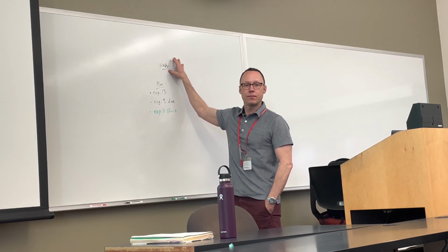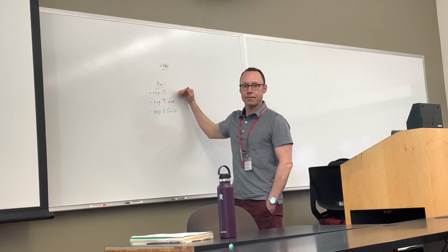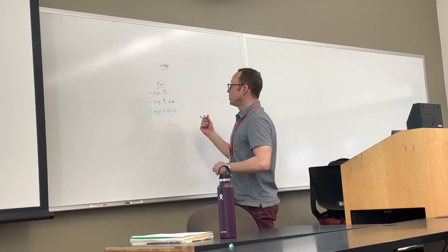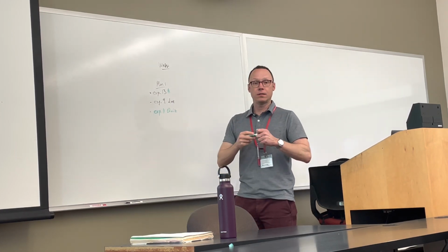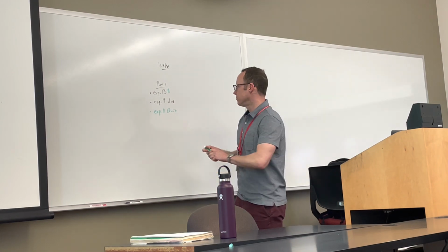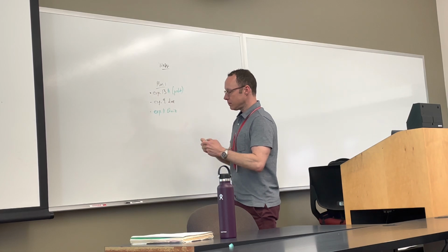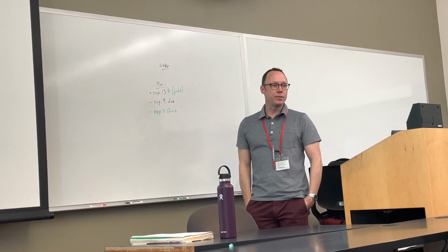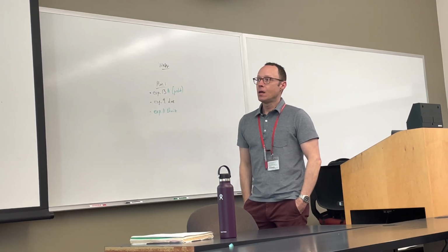So Monday we need a pre-lab? Yes, you'll need to have the pre-lab for 13 for that. Experiment 13 is a 2-reaction sequence, so you really just need the first half. There's a part A and B for experiment 13, but you just need to have the 13A prepared. Okay?